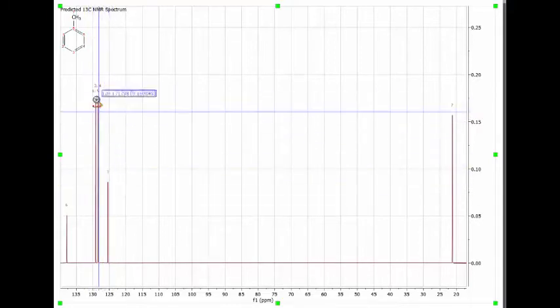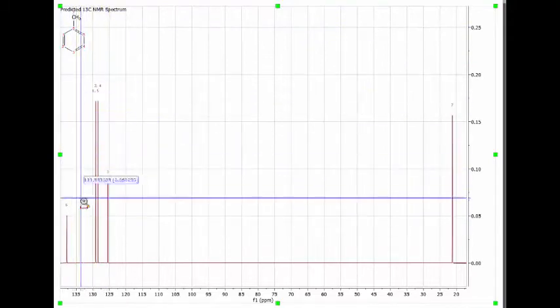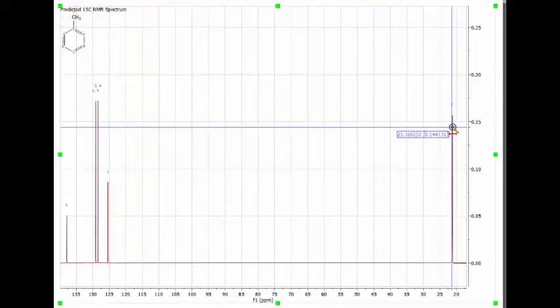That's the way it should be. I'm also not surprised to see that a carbon with an H bound and the quaternary are different heights. Again, that makes sense according to what I was just explaining. What is a little odd, although it also makes sense, is that it predicts that the methyl carbon would be vastly higher than you might predict.